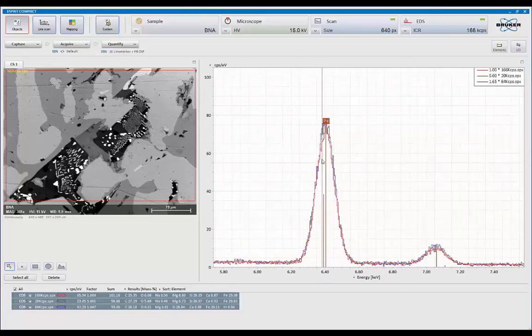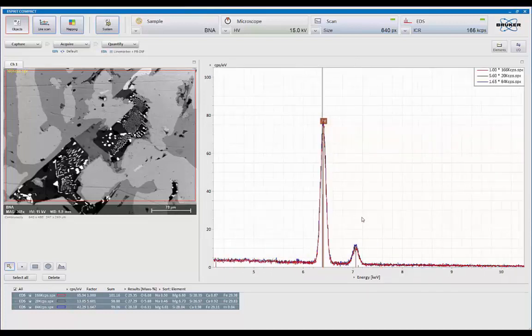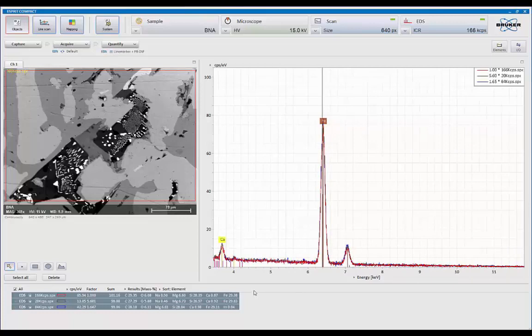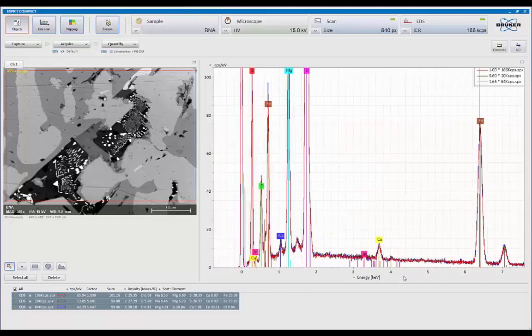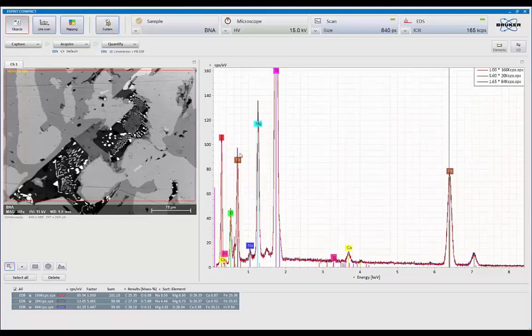And the first thing we're going to look at is our iron peak. And notice that the position and the full width half max, or resolution, is exactly the same. The other thing taken notice, too, is that the iron L to K is exactly the same among those three spectrum.